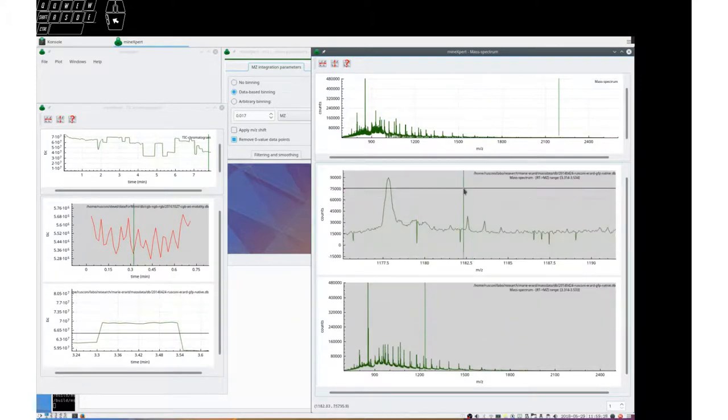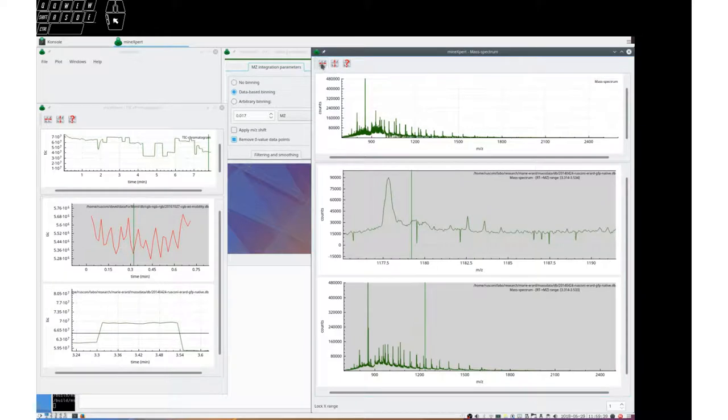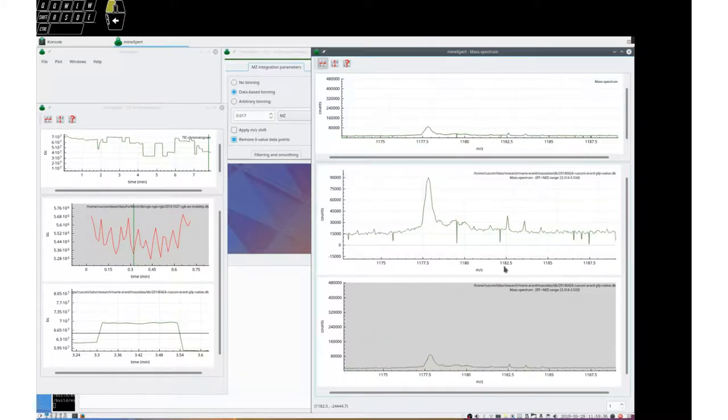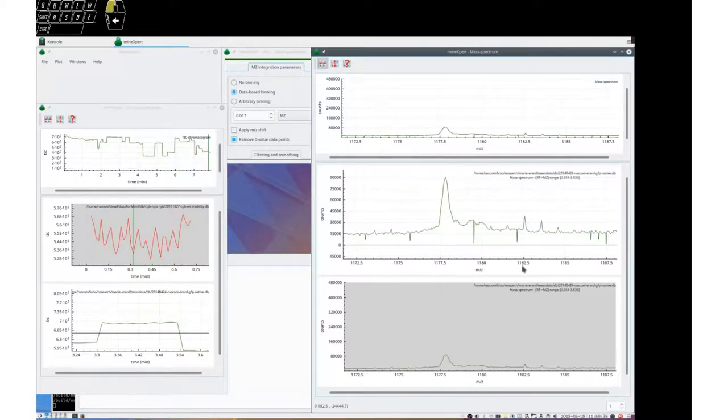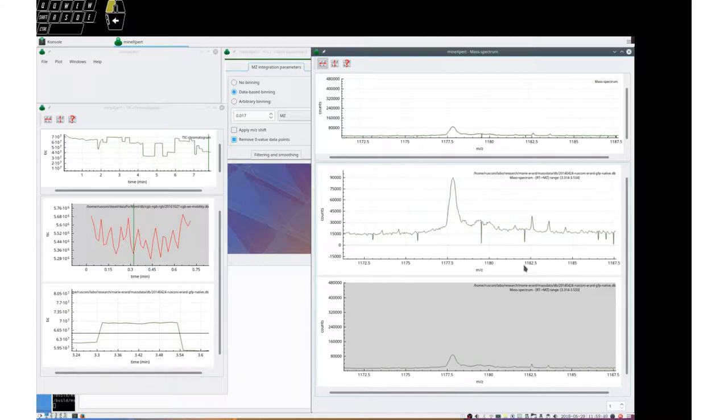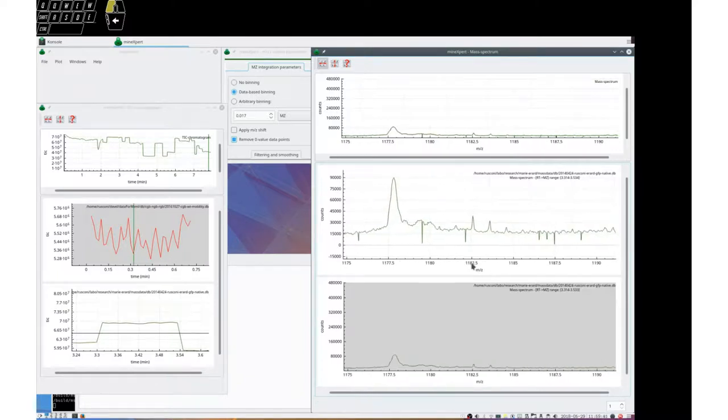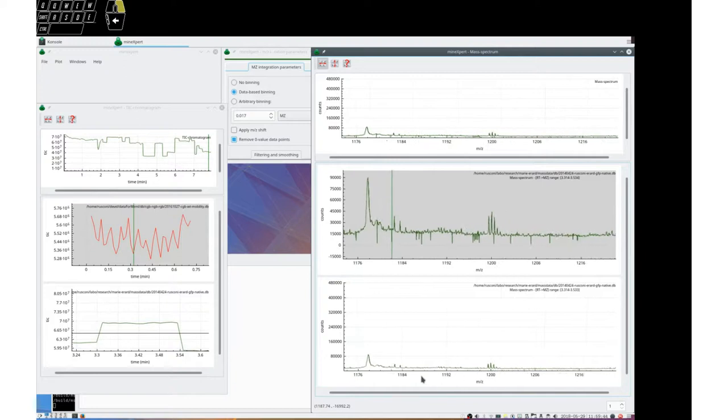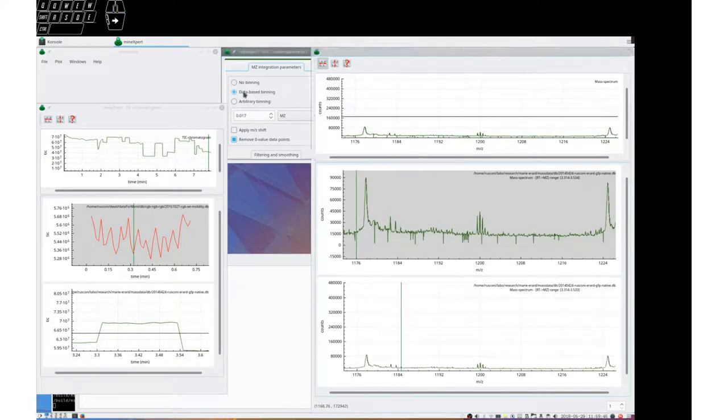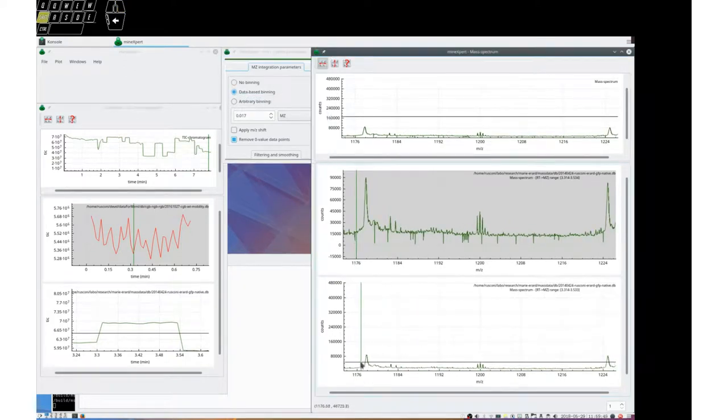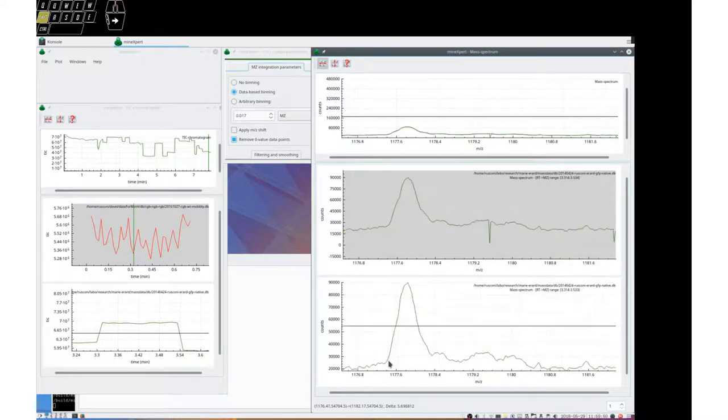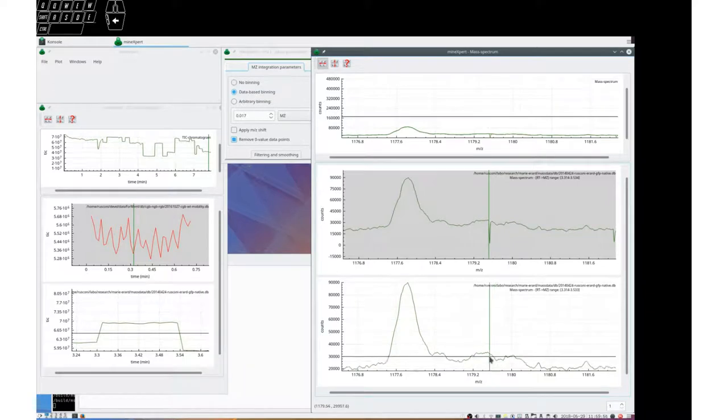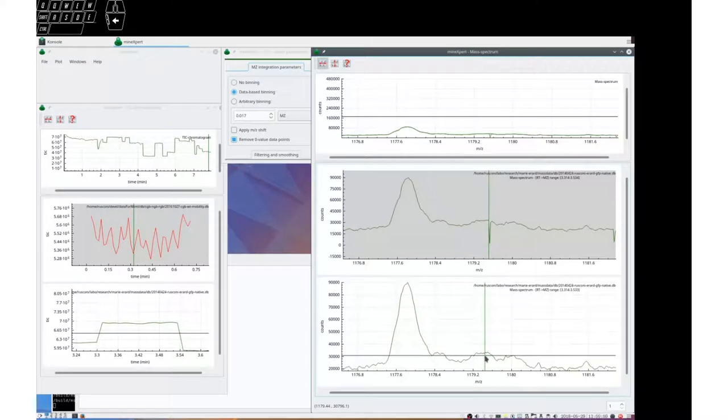As you can see, let's remove this older integration. And you see here there are three buttons. This button locks the MZ range. So we can see now that all the traces move along. And what we see is that by integrating in the data-based binning manner, the spikes have gone.